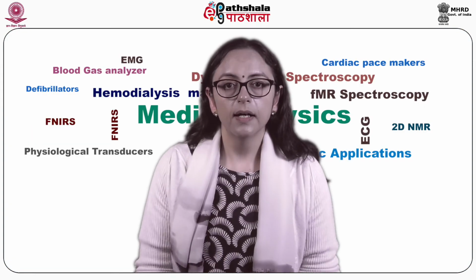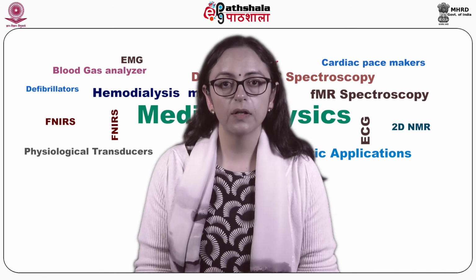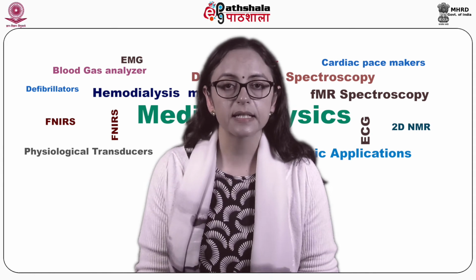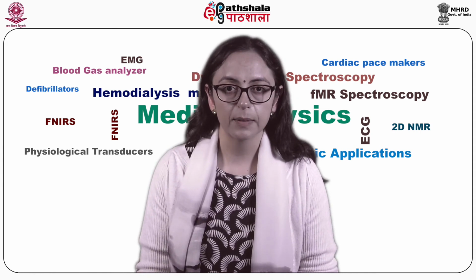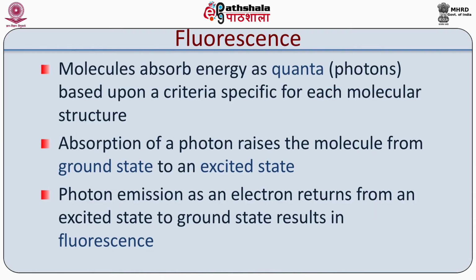So, what fluorescence is, and what properties of a fluorochrome are selection criteria for designing flow cytometry experiments, will be reviewed. Now, a fluorescent molecule absorbs light energy over a range of wavelengths that is characteristic for that molecule. This absorption of light causes an electron in the fluorescent compound to be raised to a higher energy level.